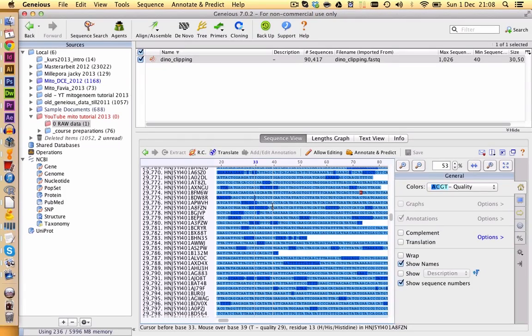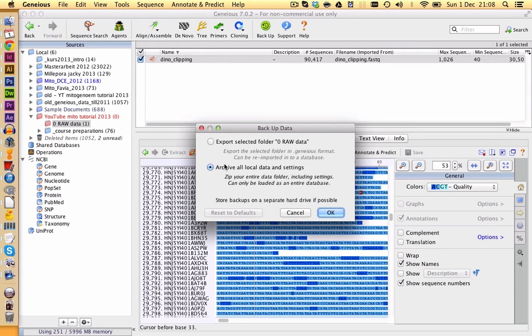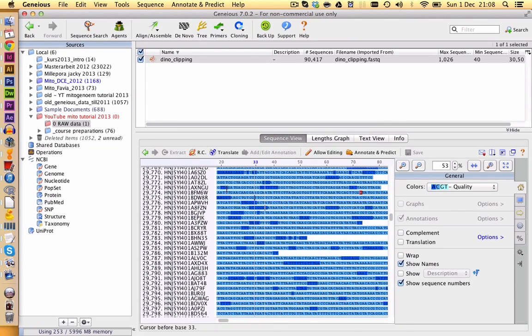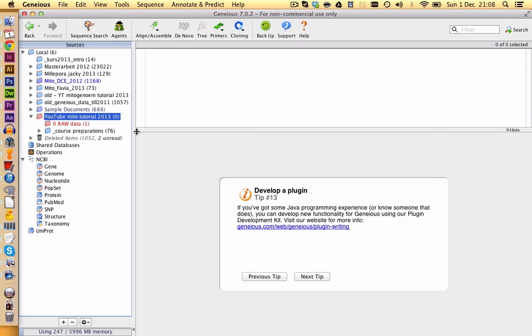One important thing I want to tell you now is that you should make backups. So with file, backup data, you can create backups of all your files. Or you can just choose to backup folders of your Genius files. So for example, we could select this folder here and make a backup of just our mitochondrial tutorial folder. I would highly recommend to do those backups on a weekly basis. So maybe every Friday. And to have those backups also saved in a chronological order on your hard drive.